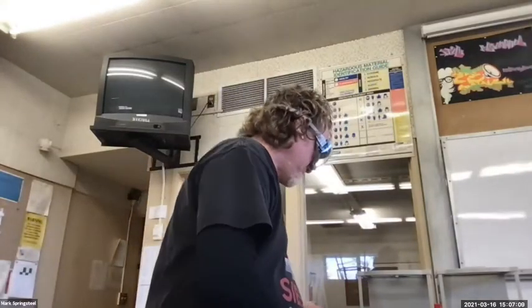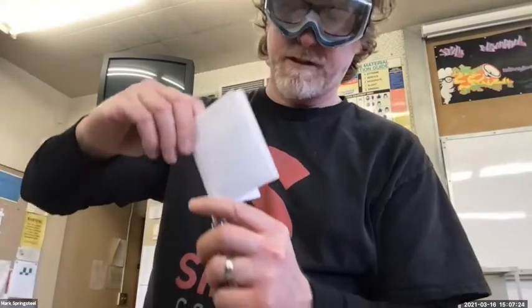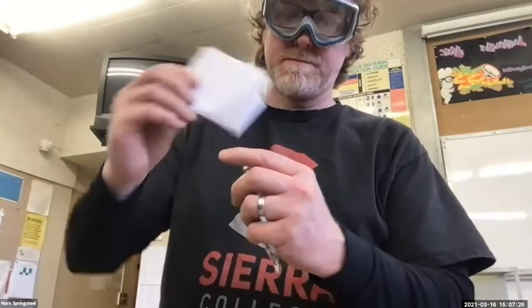Now this amount of benzil, I'm going to put that in my centrifuge tube. And since it's on a nice crease here, I should be able to do it. Get a good transfer. Yeah, that worked out pretty good. So I've got a little bit of benzil in there.